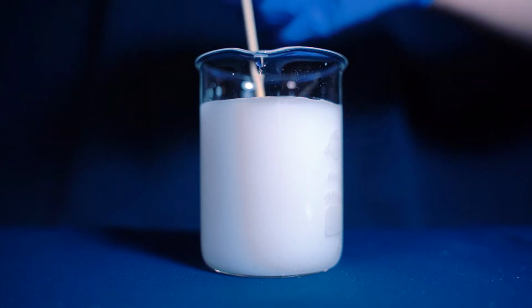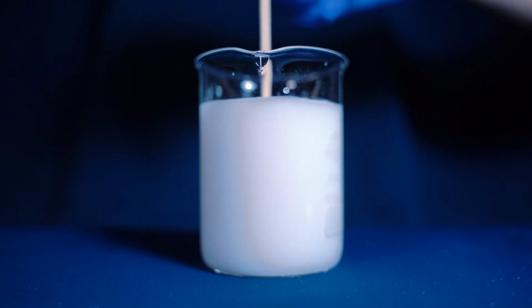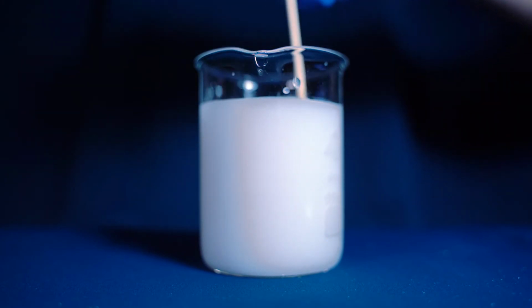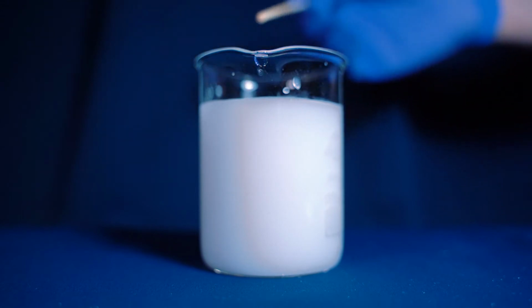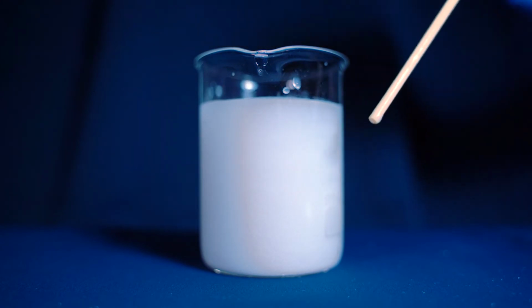Now it might not look solid. Look at this. You might say, oh, that just looks like all liquid. But in reality, the white stuff is a solid precipitate, because no matter what I do, it cannot dissolve. And if I let this sit for a couple hours, all that white precipitate will settle to the bottom.